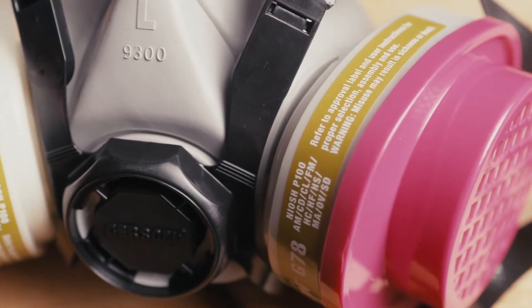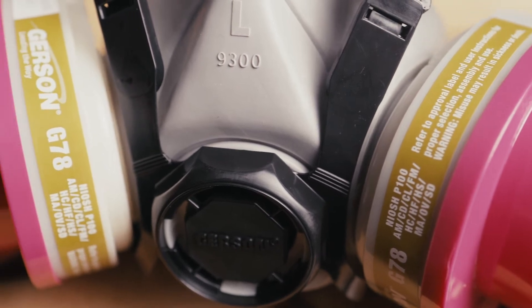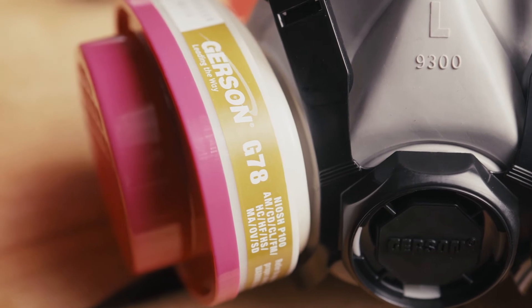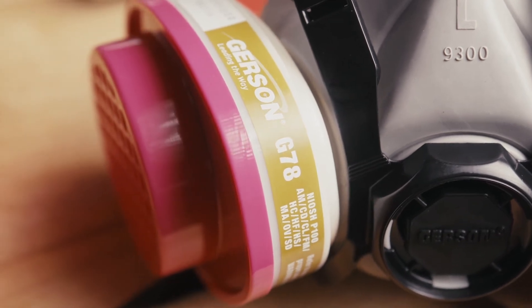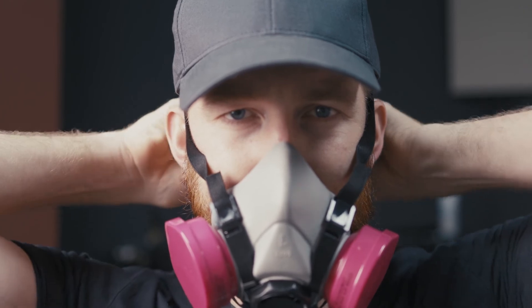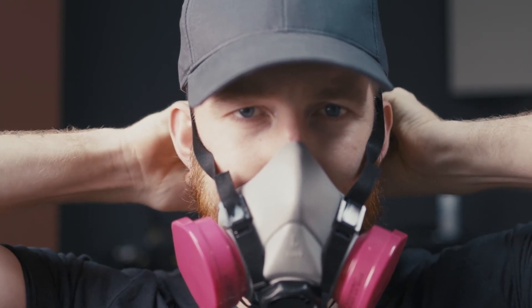This last filter, the P100 multi-gas, will protect you, as the name suggests, from a multitude of gases such as ammonia, hydrogen chloride, hydrogen sulfide, as well as other organic vapors. Granted, the dedicated organic vapor filter will do a better job at filtering out the specific gases and fumes that it's rated for. But it doesn't mean this multi-gas is any slouch, because it still provides more than adequate protection in a lot of environments.